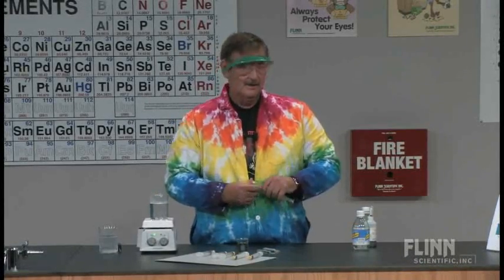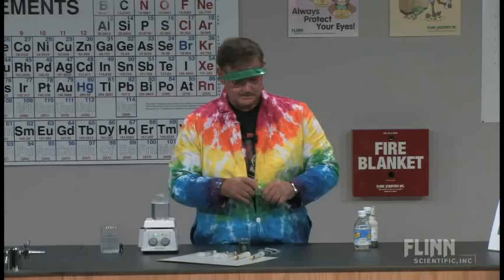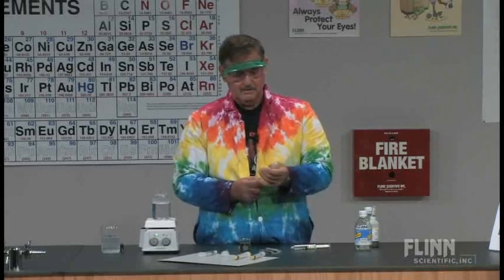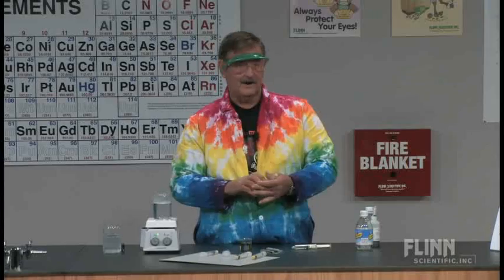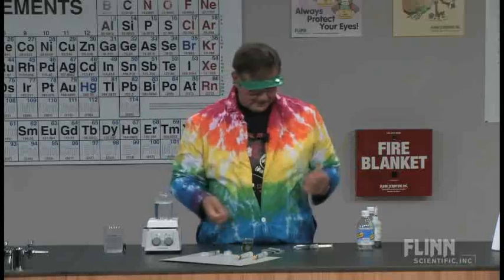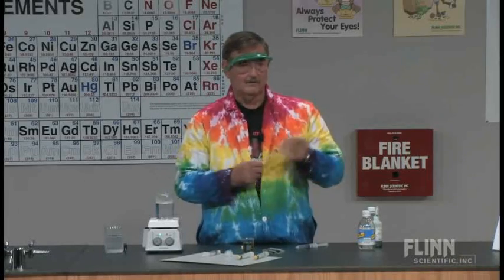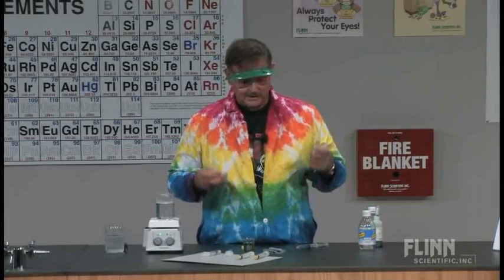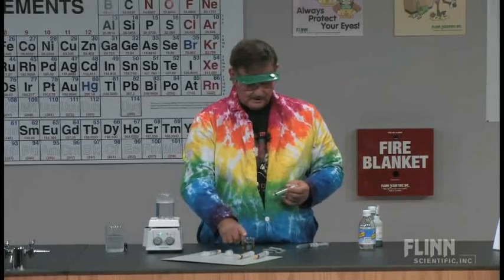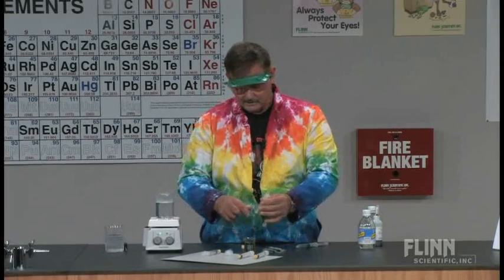I let them do this: first thing they want to do is pull the syringe and pop the tip caps off. So I let them do that, but then I tell them they've got to find them. So we're going to take about two milliliters of the bromocresol green and put it in the syringe.